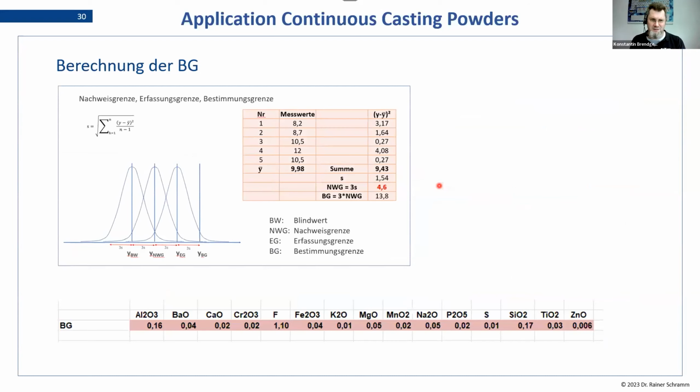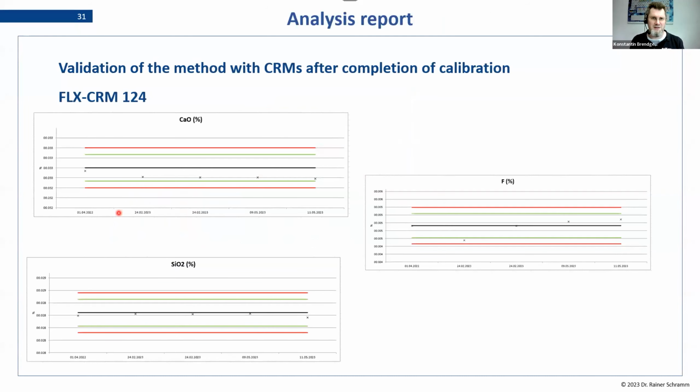So this is one of the sheets that explains how we get our limits of detection. Quickly speaking, we do 10 blanks, and it's 9 times the standard deviation. So basically it's just the area of trust around this, to see how we can be sure that this is not zero. But there are other webinars, as I said. And here is a bit more data from our settings.